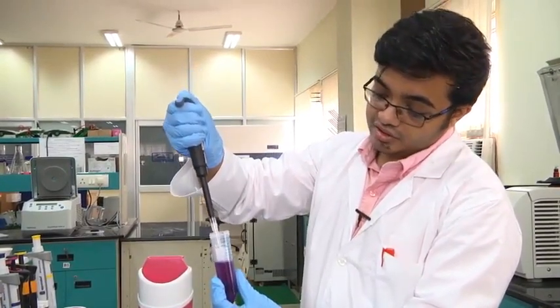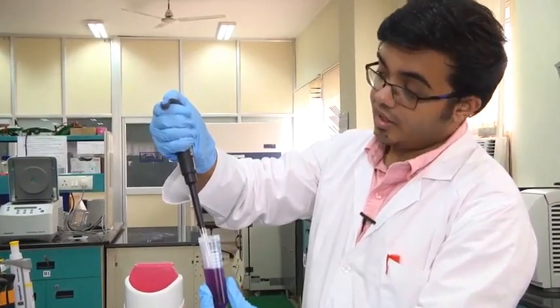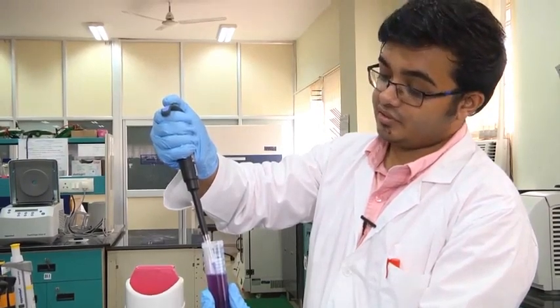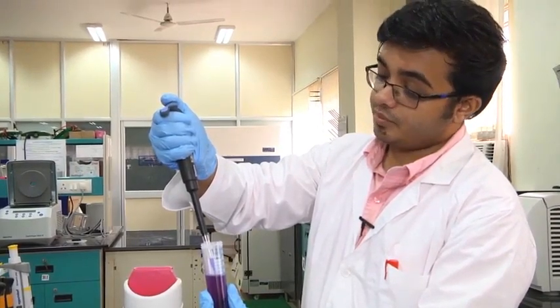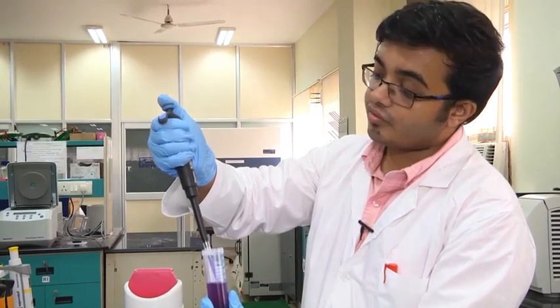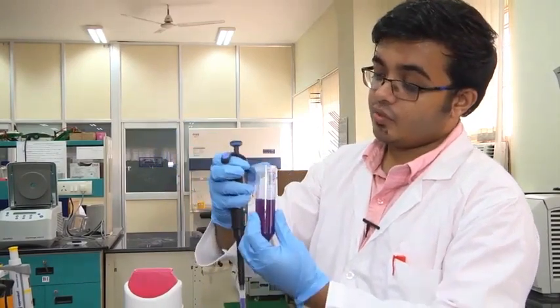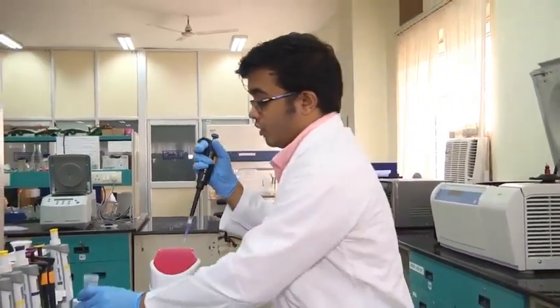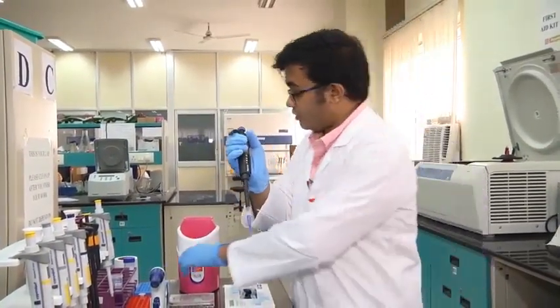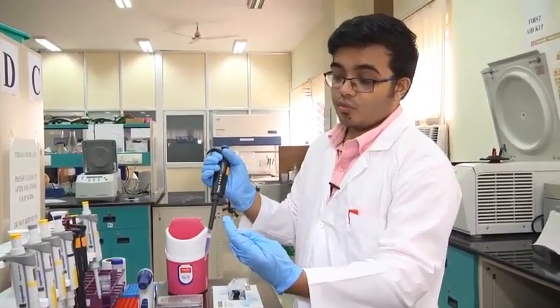So a good idea is to just dip it maybe half a centimeter inside the liquid, and then gently but uniformly release the pressure of your thumb on the piston. As you keep releasing the pressure, the piston keeps moving up, and you are collecting the desired volume that you have calibrated the instrument to collect. I've set it at 1000, and what I have here is 1000 microliters of this solution, which I am now going to dispense into the tube where I want it.